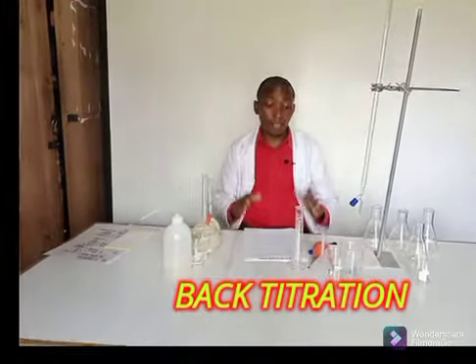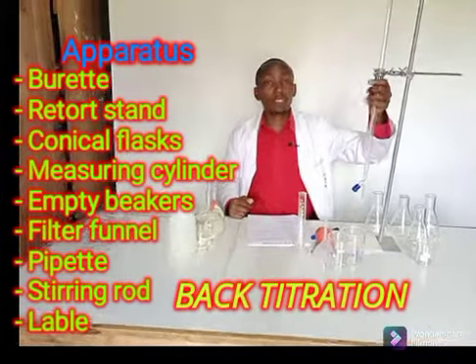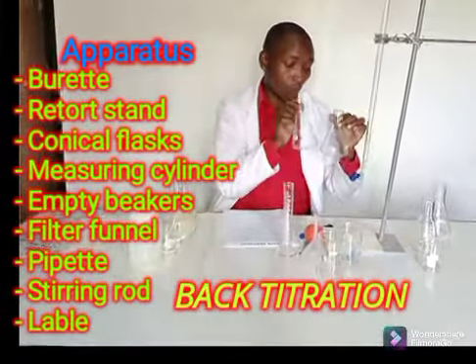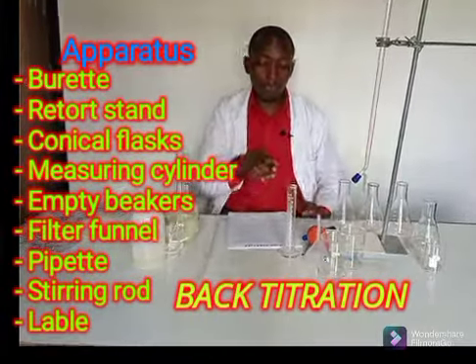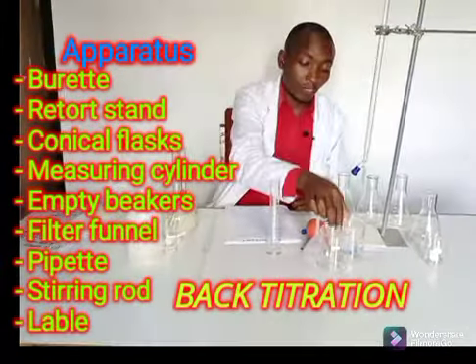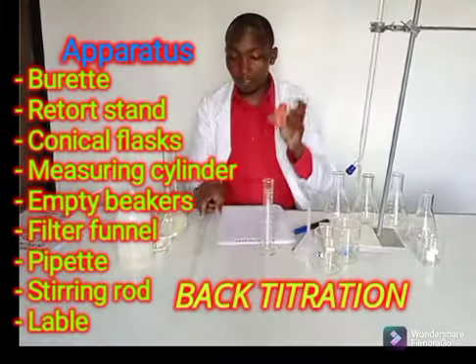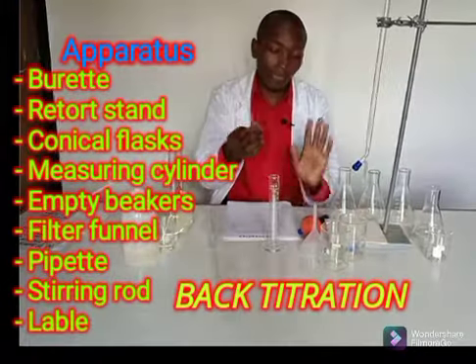And the apparatus that I'm going to work with: I'm going to have a burette that is well mounted on a retort stand. For this case, I'll do three trials, so I will require three conical flasks. I'm having a 50 ml measuring cylinder, two empty beakers, a filter funnel, a pipette filler, and of course a pipette. Good. I'll have a stirring rod.